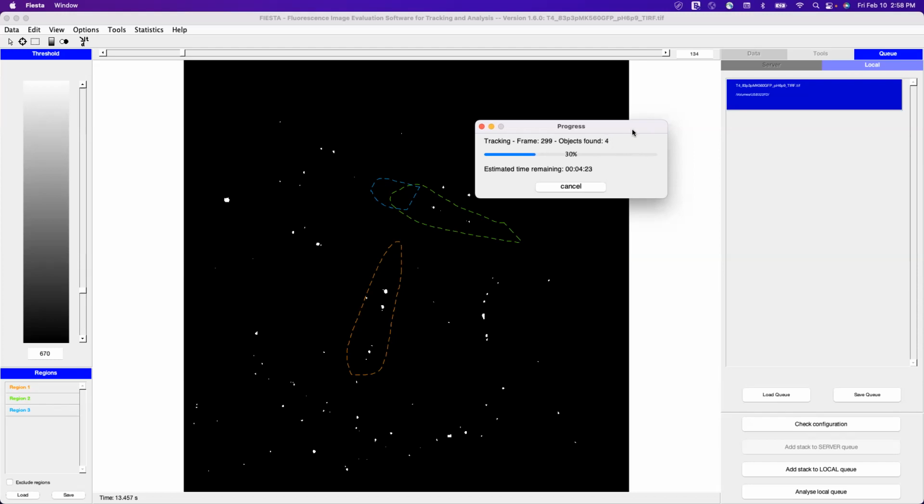I'm assuming they just had a lot of data and built it on that. What it's doing right now is literally just applying 2D Gaussian fits to everything. It has no idea what is connected to what. It's just going frame by frame, applying fits, and saying for this frame I find this number of objects. It says objects because they might be molecules or filaments.